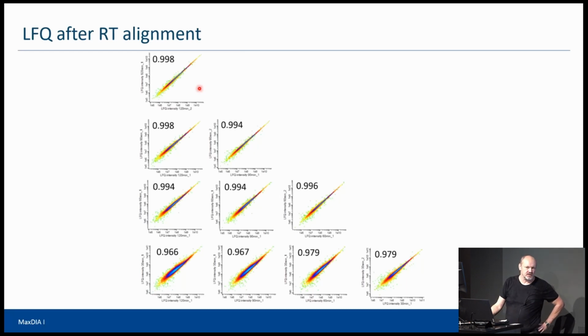Are there any questions? There's actually one question over there. Different DIA runs for different samples will have the same gradient, but sometimes the previous DDA run to create the library can be a different gradient, to salvage more. So in that case, it can be possible if I run a longer gradient to create the library. So retention time information is in the library, but the DIA runs are shorter.